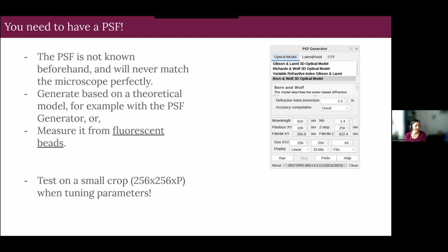Yeah, so I think in the portfolio assignment that you have, there are two algorithms or two plugins that you have to try. One is called 2D deconvolution, the other one 3D deconvolution, and you have little videos that show you how to use them. It's quite straightforward, so I think it should be okay. Otherwise, you can ask us. Aphrodite.